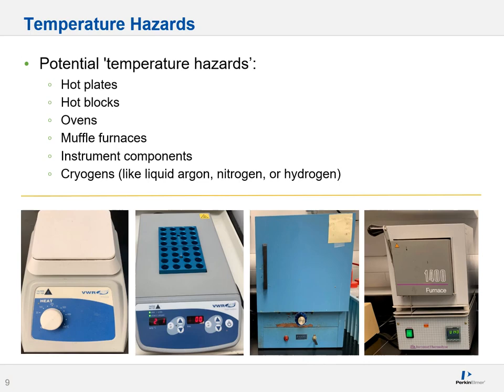Let's talk about potential burning hazards. Items such as hot plates, hot blocks, ovens, muffle furnaces, and sometimes even instrument components are rather hot to the touch, so be careful when you approach these. If you even suspect that any of these accessories or instruments has been set at any level of temperature, use a thermometer or other measurement device to assess whether it's dangerous. Sometimes evaluating these is easy if there's a temperature gauge up front, but other times you have to be more cautious.